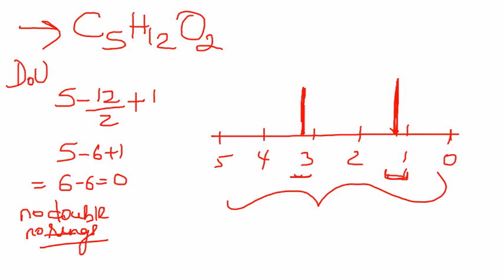How would you go about it? Now, you might start thinking, okay, I have 2 oxygens, how could those be present? Maybe it's a possibility that it's an alcohol. And so let's try to put some structures out there. Realize that if it were an alcohol, then that OH is going to count. So that will be one environment. This will be one environment, which will be the same as that. And these 2 will be one environment, and that will be one environment.